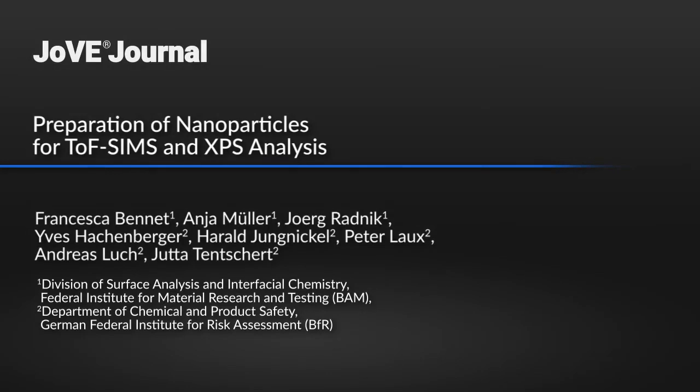Because of the unique properties of the nanoparticles, the sample preparation has a significant influence on the surface analysis measurements. These methods provide several different options for sample preparation, depending on the analytical question at hand and the form in which the nanoparticles are available.